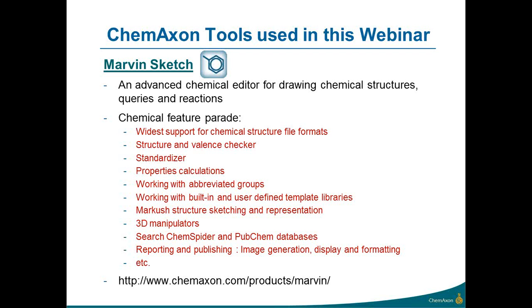And I would like to quickly go through the list and make you aware how powerful our drawing sketch is. First of all, it supports a lot of chemical file formats. I can basically use all types of chemical structure file formats.